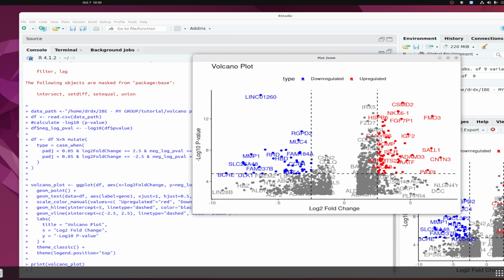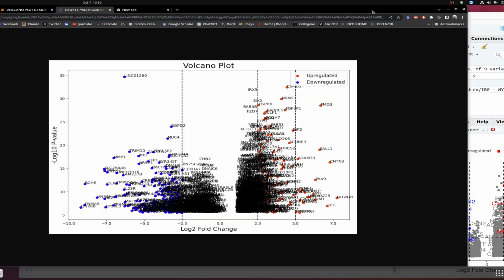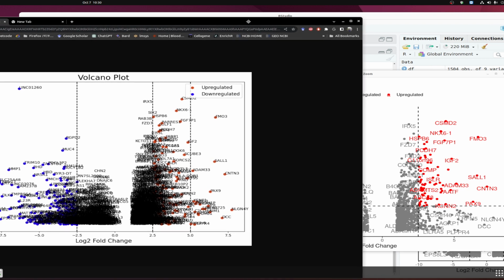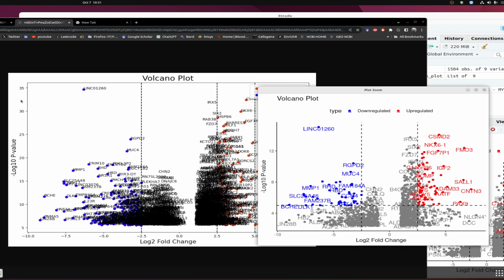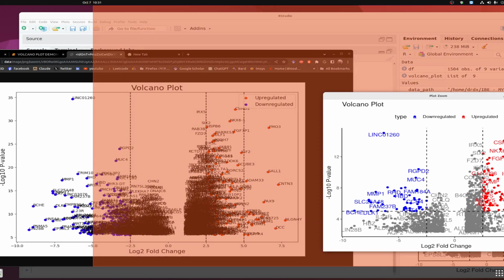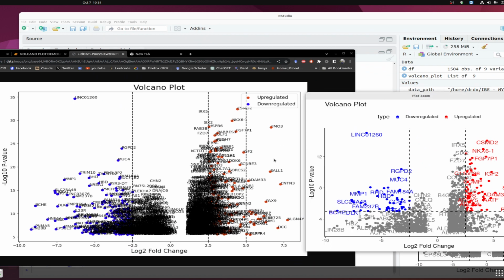And then we have the Python, and we do this, so we can just open in a tab. So if I put them side by side, you can just see the left one is generated using, just probably like this, make it smaller. And this is our package. So we used the same data set, and we generated plot using the R program as well as Python program, and you can see both of the figures in here and here. So this is so reproducible, and you can compare.